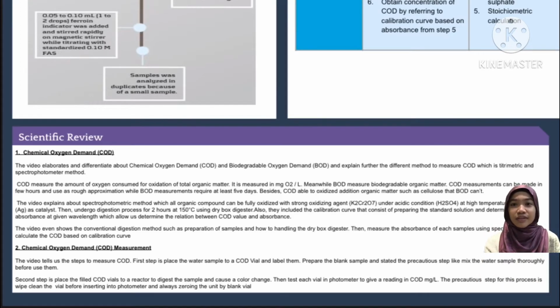The second video is about COD measurement. The video shows us step-by-step handling of the experiment. First, how to prepare the blank samples and samples. Then, how to run the digestion method.